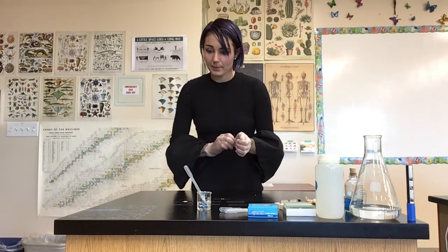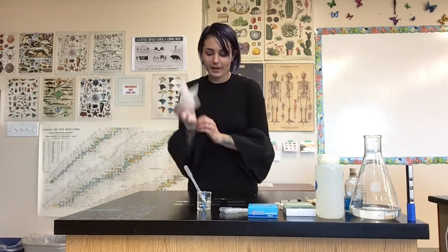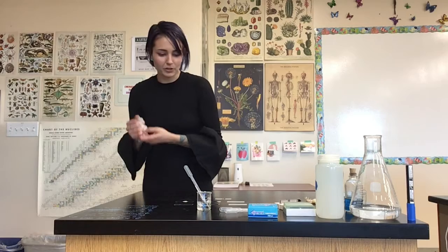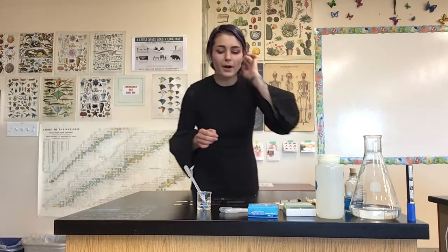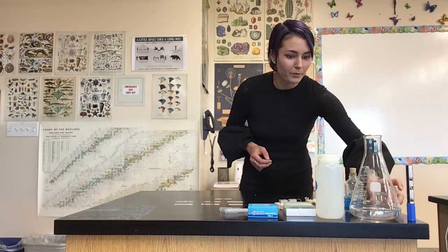So now what I'm going to do while we're waiting for those to soak, I can take off my gloves because I'm done using the hydrogen chloride. For the moment, I'm going to get a new pair of gloves when it's time to blot it. Probably should have kept my gloves on while I moved that.